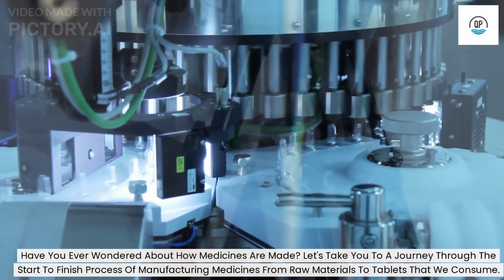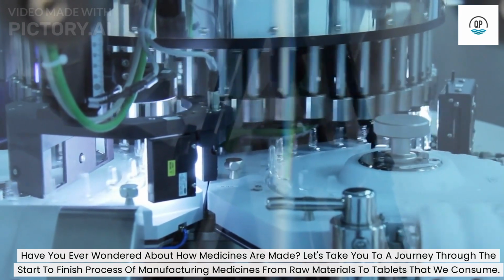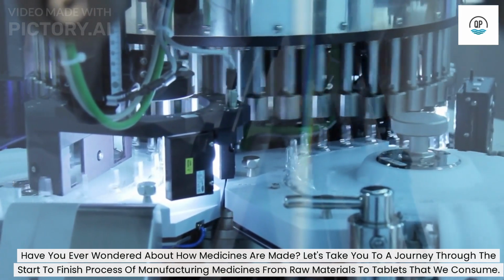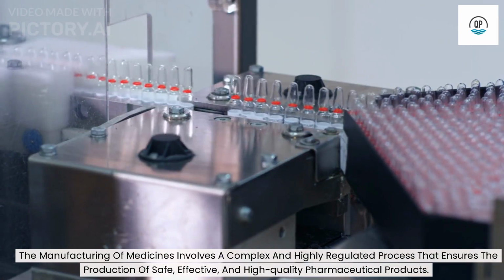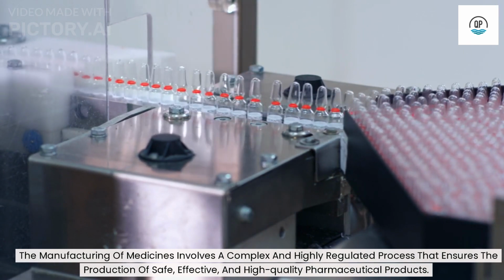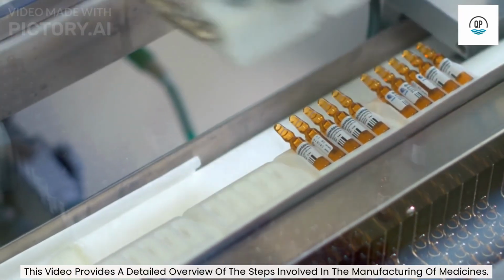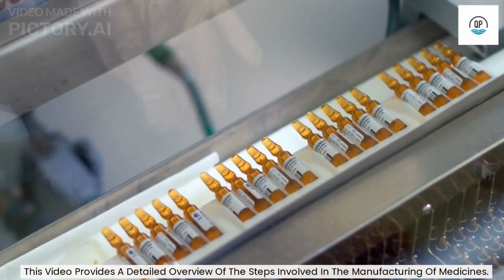Let's take you on a journey through the start-to-finish process of manufacturing medicines, from raw materials to the tablets that we consume. The manufacturing of medicines involves a complex and highly regulated process that ensures the production of safe, effective, and high-quality pharmaceutical products. This video provides a detailed overview of the steps involved in the manufacturing of medicines.